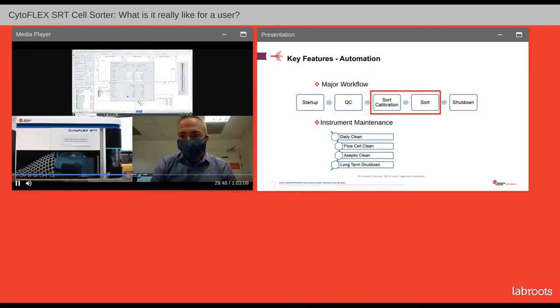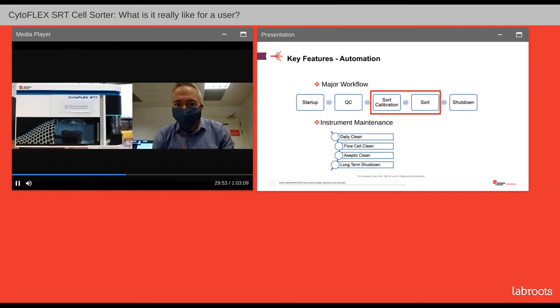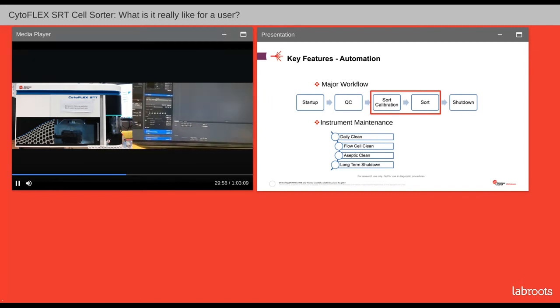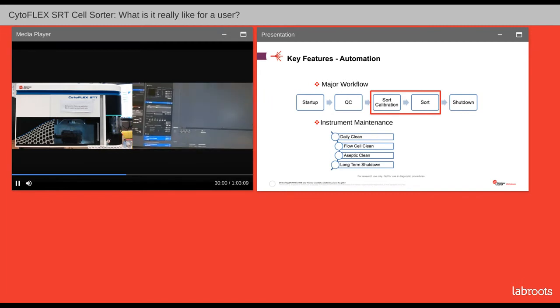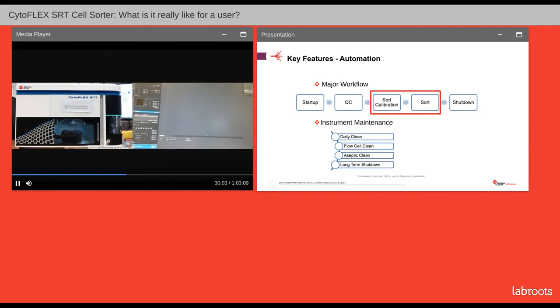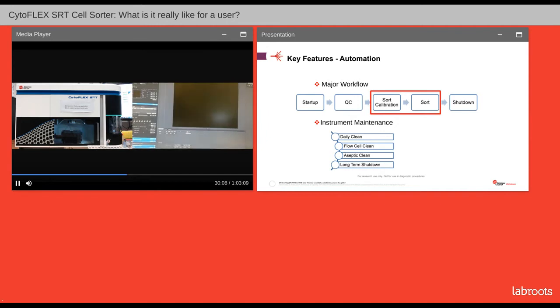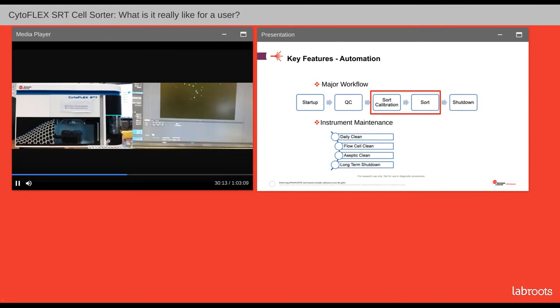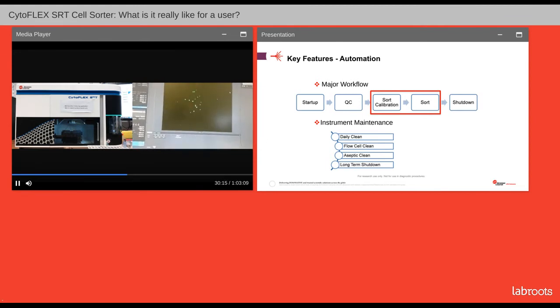Pete will hopefully be able to tell us how many GFP cells there are. Nothing like a bit of pressure! Right — I need you to be able to see the monitor. I've got the first drop. I can see: 1, 2, 3, 4, 5, 6, 7, 8, 9, 10, 11, 12, 13, 14, 15, 16, 17, 18, 19, 20. Bingo.